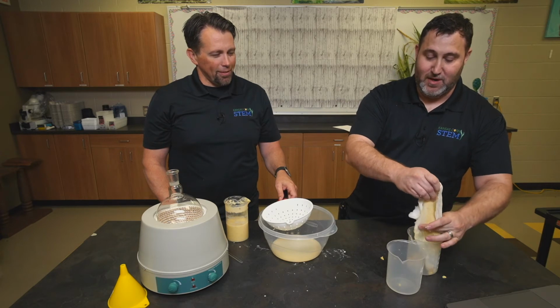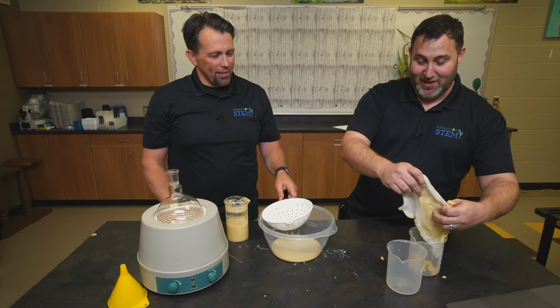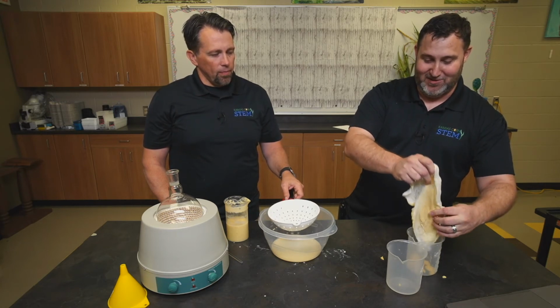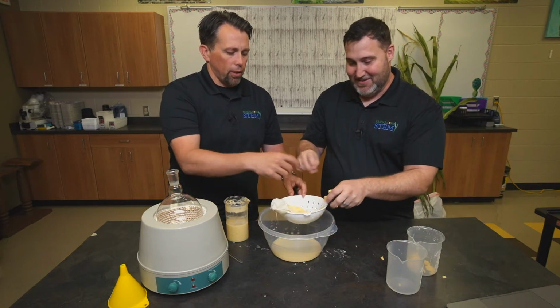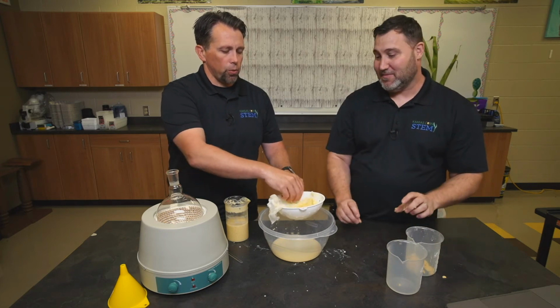Speaking of cleanup, this is definitely a messy part of the lab. The kids do love this part, though. They do mention this is one of their favorite parts. If you're running the nutrient testing along with it, that's a good saving. That corn sample there is really good as well.